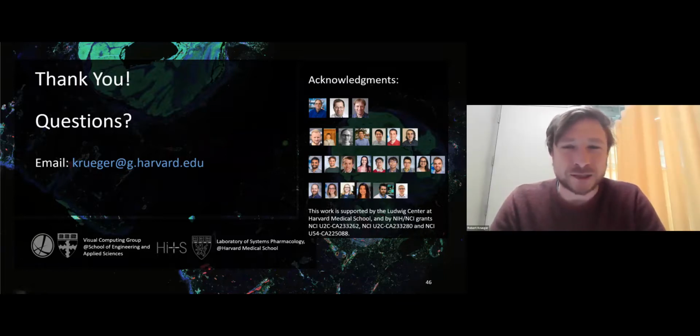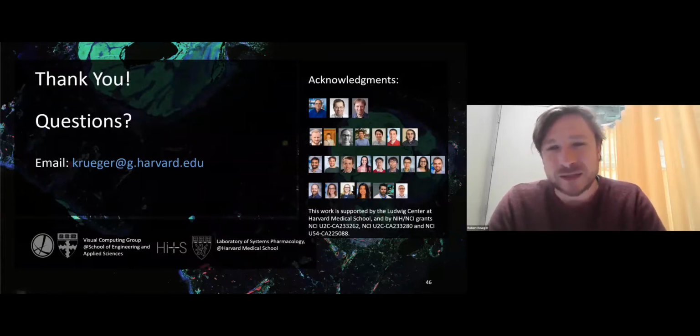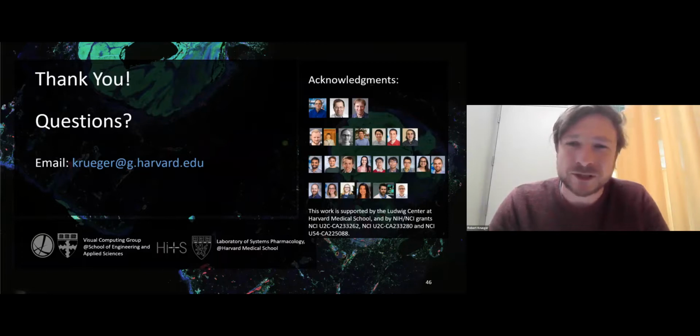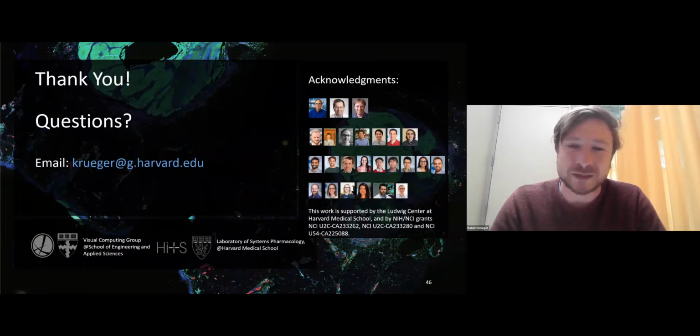We can partly, but I think there are also a lot of additional opportunities there. I have two examples in mind. Remember the Scope2Screen approach that I showed, and the annotations? We call these rich annotations, because we don't only take an image, but we store the area where the region of interest lies. We crop out a mini dataset from the CSV file, and we store the channel combinations that were used to derive that. So you can restore that by entering that information, and the tool can go back to that position. I think that goes a little bit in that direction.